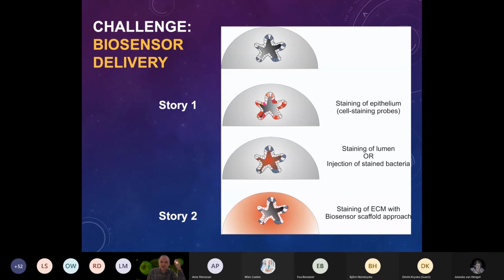Okay. And when it comes to the measurement of organoids, spheroids, gastruloids, or any physiological, engineered model, the question arises of how you can design the biosensor and how you can deliver it into the model you're going to use. If we talk about organoids or spheroids, which grow in matrigel, normally you have to face a problem of delivery of the biosensor through the layer of matrigel, especially if you want to approach it in live state, or how you can deliver the biosensor into the cells.